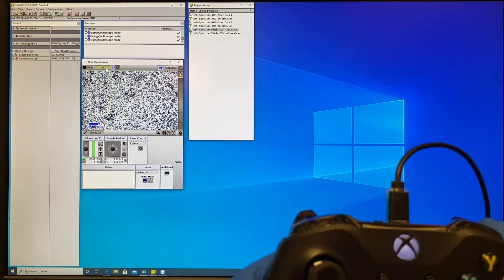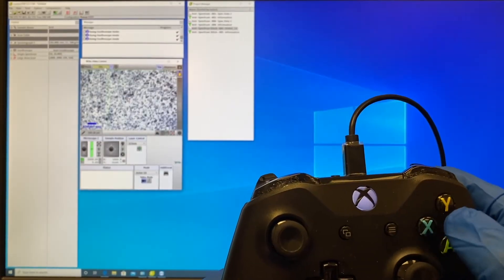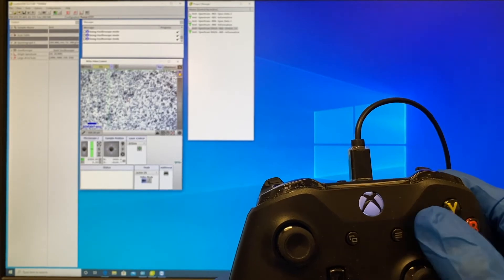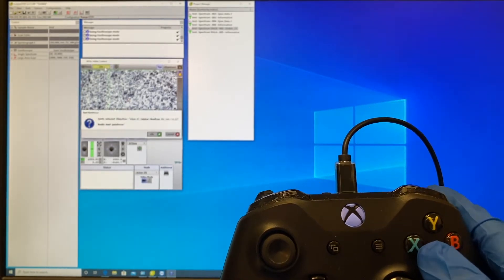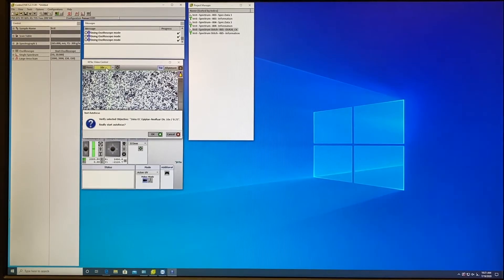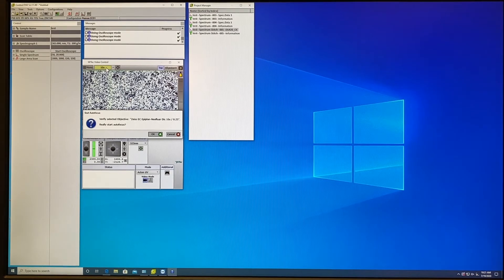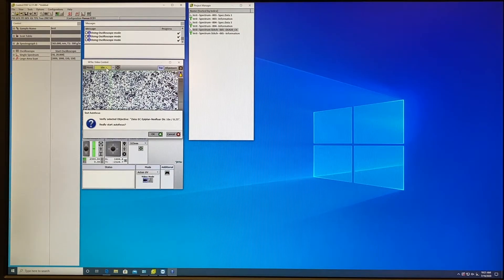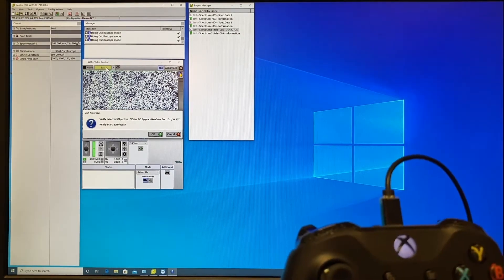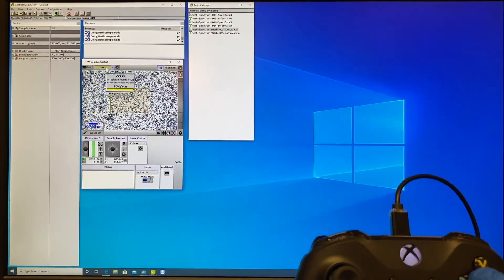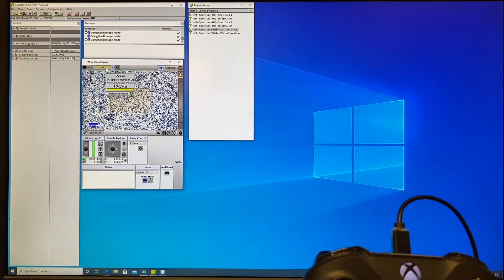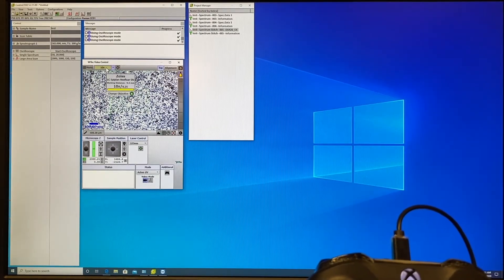You may also use auto focus by pressing the button X. Make sure you read clearly the message on the window. Verify selected objective, if it's 10x, if it's yes, press A to enable, and then it will auto focus on your surface.